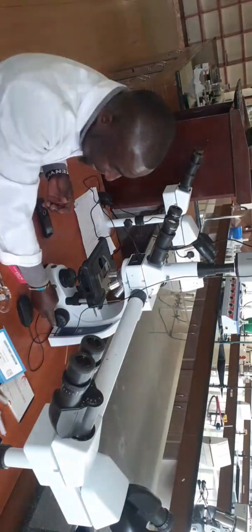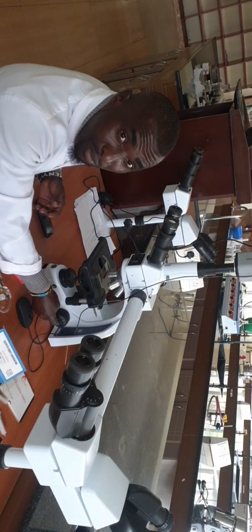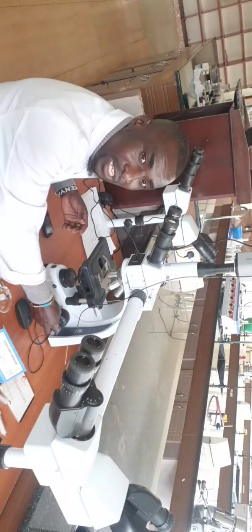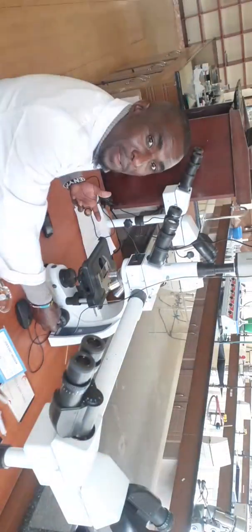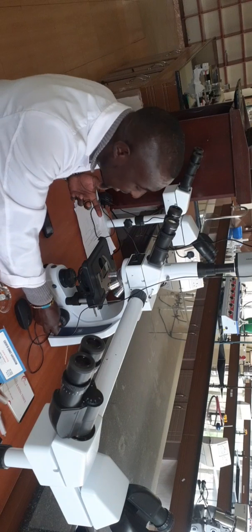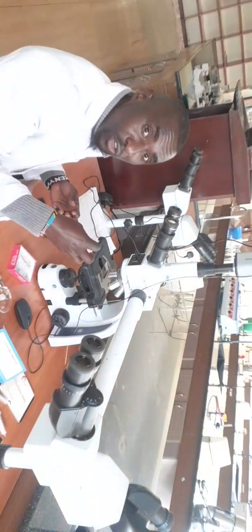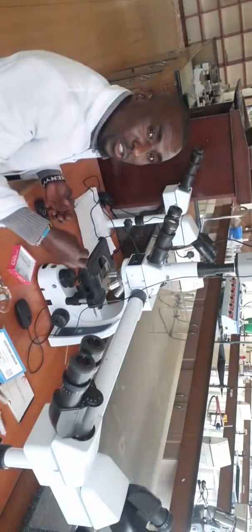Then the fine adjustment knob ensures that the specimen can be seen clearly. It helps to make a fine focus. It is usually located on top of the coarse adjustment knob.